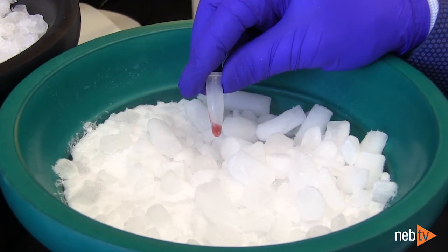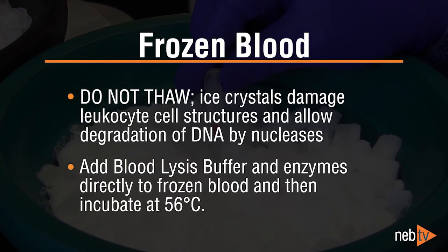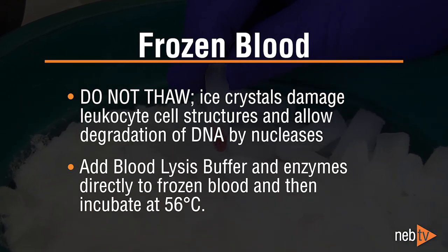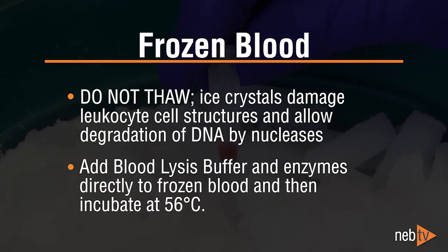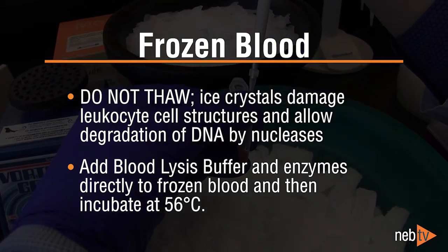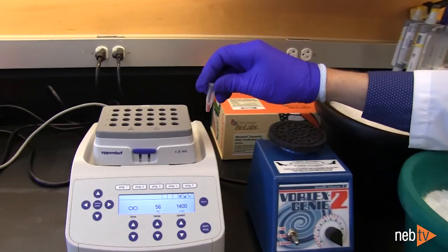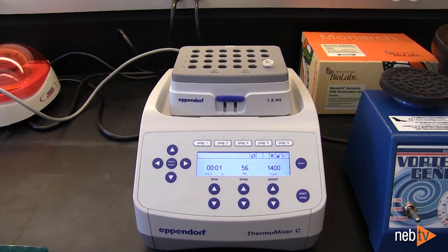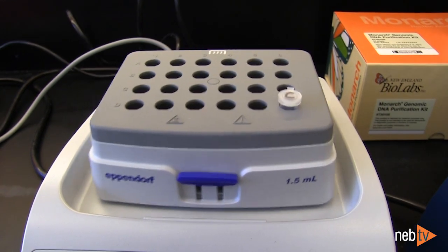Frozen blood samples will give genomic DNA of excellent quality, but it is essential that samples are not thawed before purification. This is because ice crystals damage the leukocyte cell structures during freezing, and upon thawing, the nucleases will rapidly degrade DNA, reducing quality. When working with frozen blood samples, add the RNase A, proteinase K, and blood lysis buffer to the frozen sample, and then incubate immediately at 56 degrees Celsius. The blood lysis buffer protects the DNA from nucleases as the sample thaws, ensuring that large genomic DNA fragments are obtained.